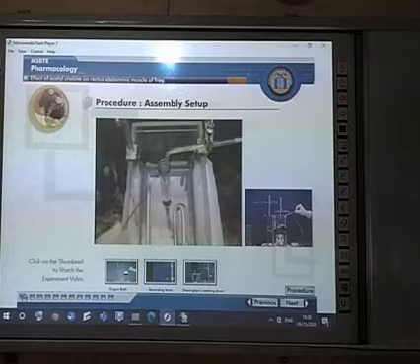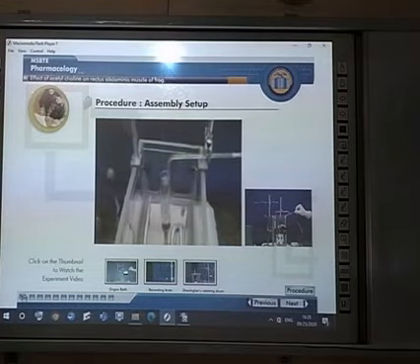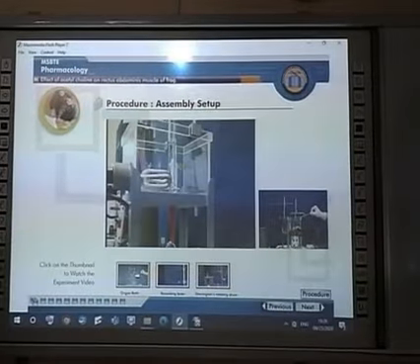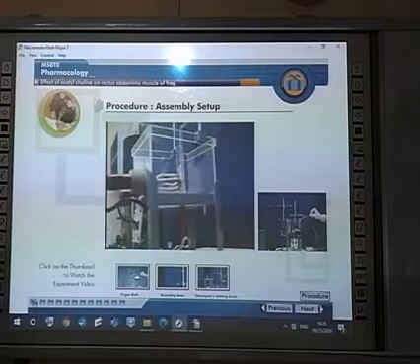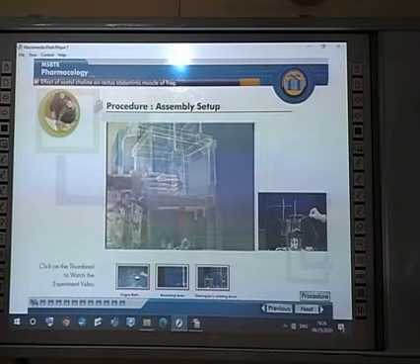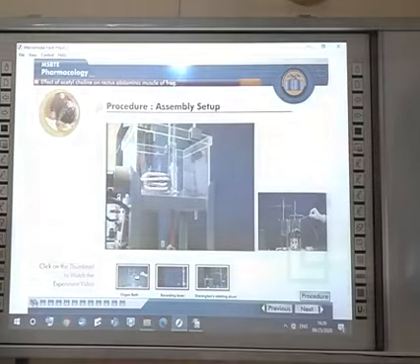Isolated muscle preparation is mounted in upright position in this tissue bath. The aeration tube made of glass has dual functions. One, it will aerate the mounted muscle preparation, and second, it serves as the tissue holder.